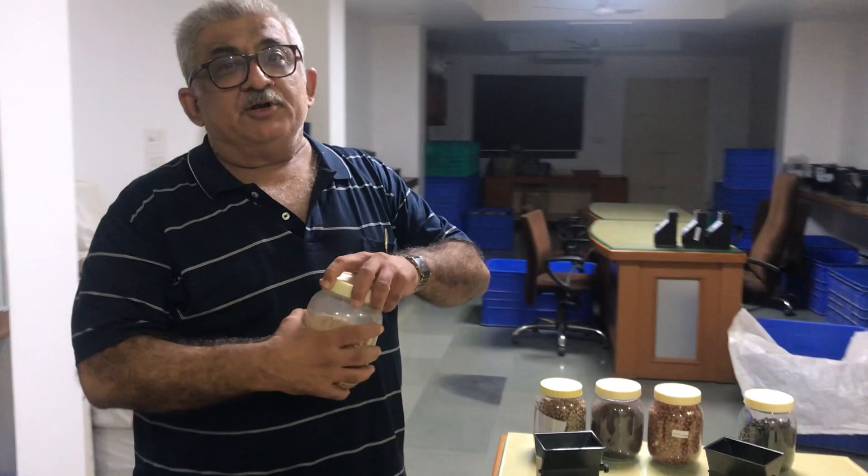Today, I will demonstrate the moisture content in soya bean seed.